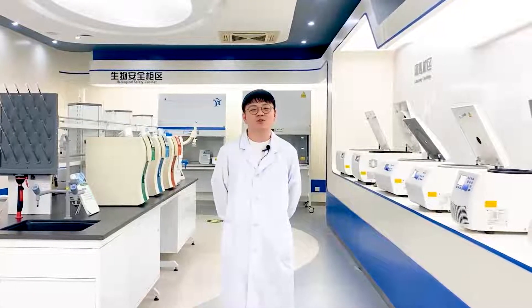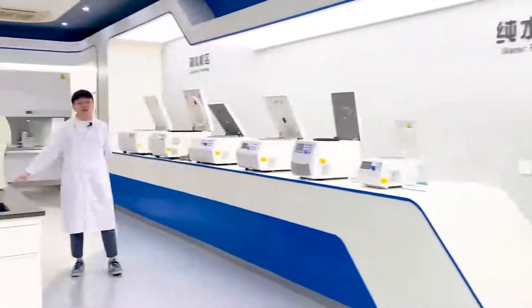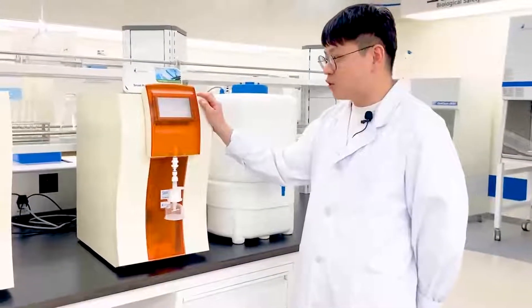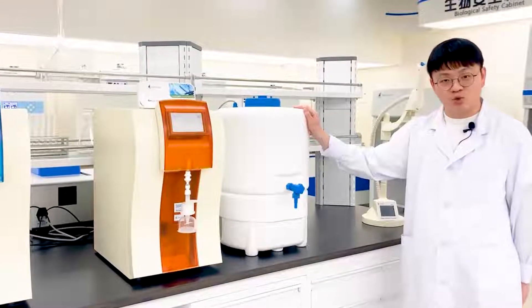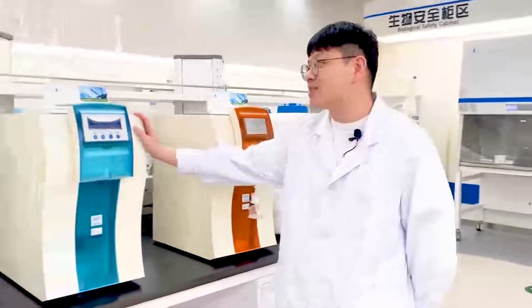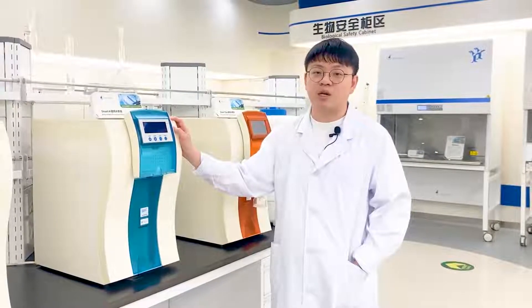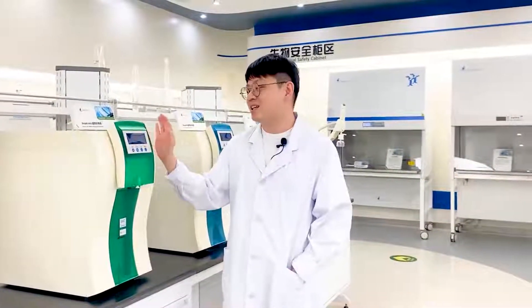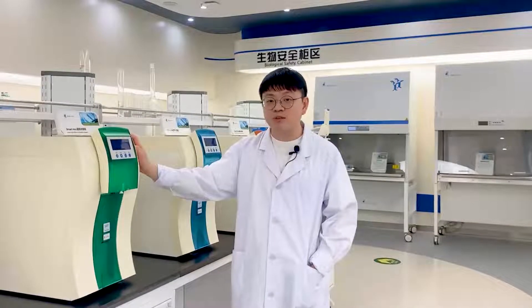Today I will introduce our water purification systems. We have flow type and bench type. First, our Smart Plus series, which has a bigger and smarter touch screen with TOC online monitoring and EDI module. The water tank has dual UV light and air filter. The Smart N series lets you choose one or two RO modules for 30 or 50 liters per hour output. Smart Mini has an internal 6-liter water tank to save space. We also have ROB models for clinical analyzers.